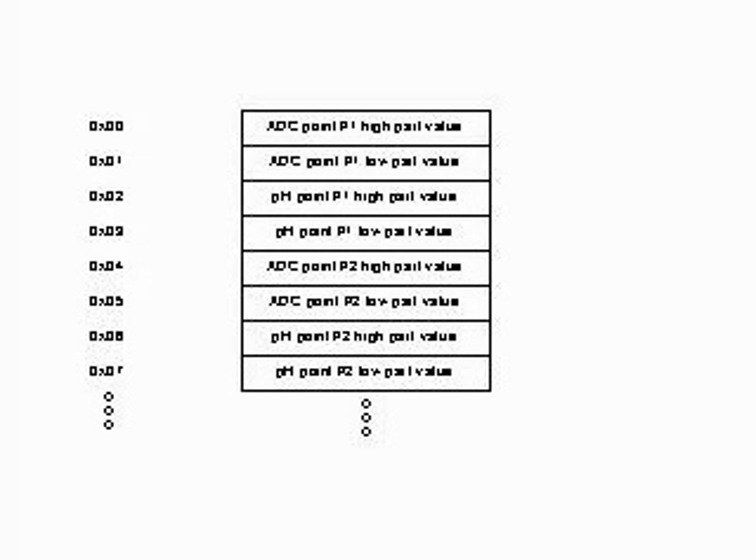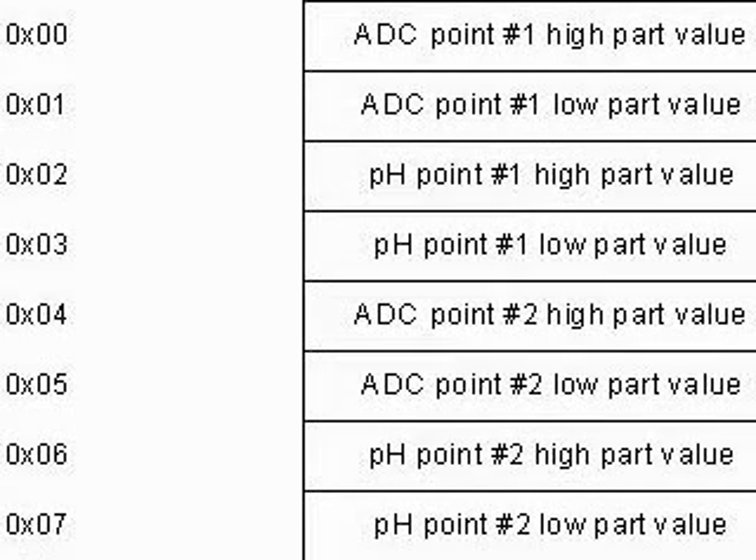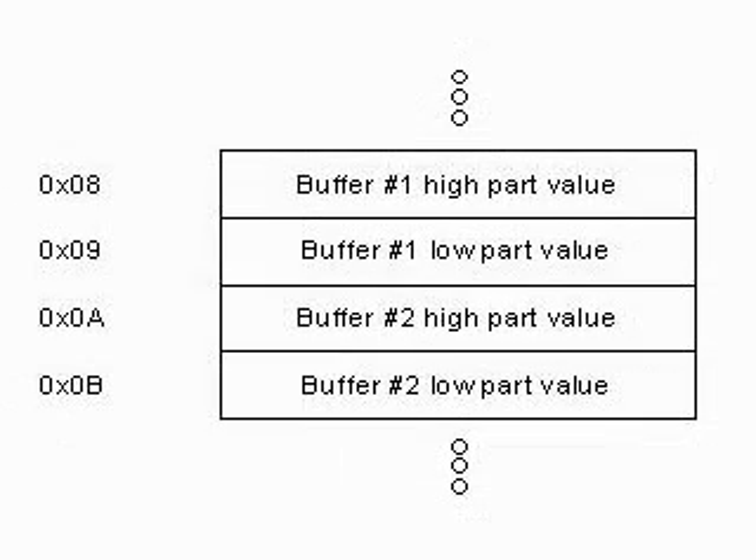The measure points will be stored in the EEPROM memory as shown. The value of the analog-to-digital converter of the PIC corresponding to the first point is cut into two bytes and stored in the lowest EEPROM positions. Following this value, the pH buffer value corresponding to the first point is also cut into two bytes and stored in the EEPROM. The same is done with the coordinates of the second point. The buffer values inserted by the user are stored in the following addresses. The buffer values are repeated because the first values are used to calculate the pH readings using the measured millivolts, and the second are used to store the values that the user considers the calibration buffers should have — these values overwrite the others after calibration. This double storage allows the user to change the buffer values without altering the measure.